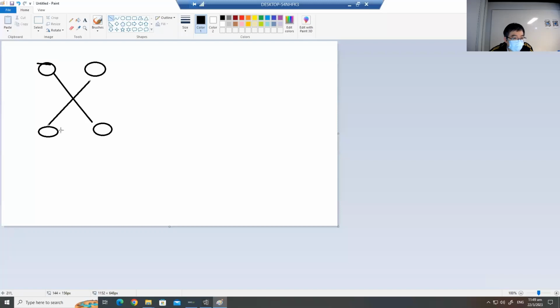That means in time, this is time point 0. At time point 0, that object is here. That means this object is moving in this direction. So they have a cross here. We will predict this object belongs to this one, and this one belongs to this one, because of the motion in the previous time point.